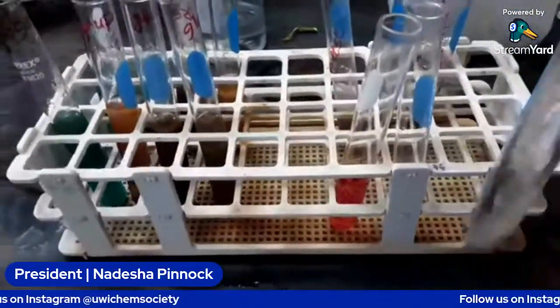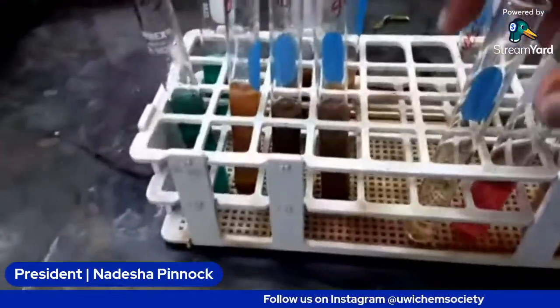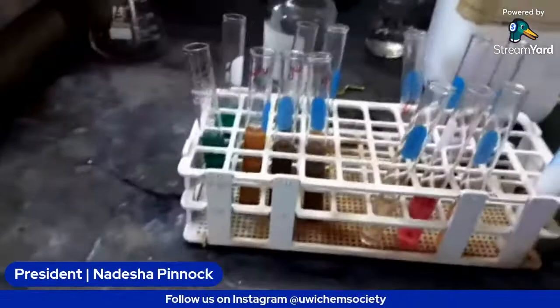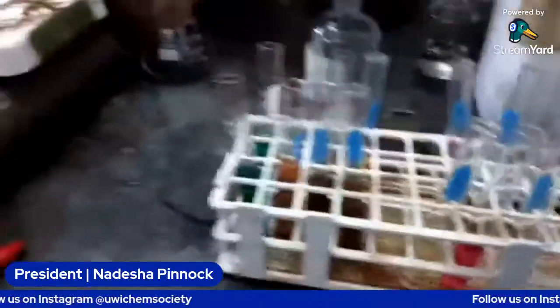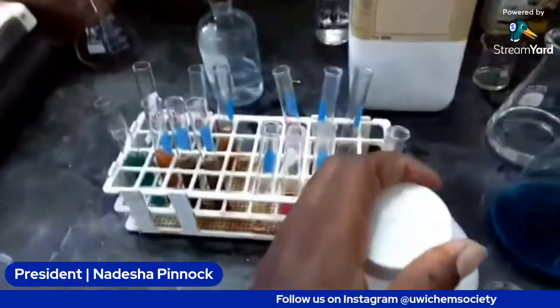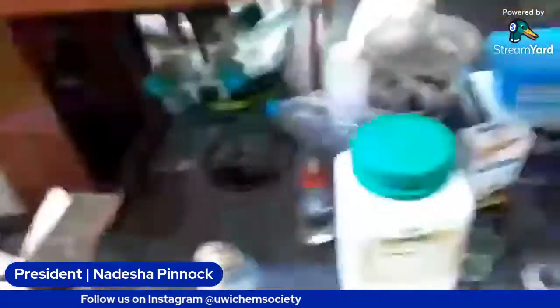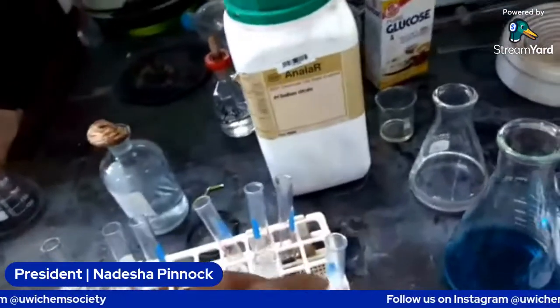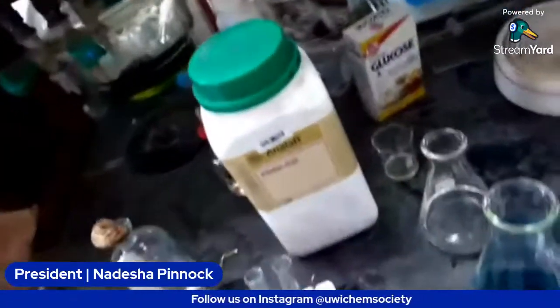So we shake it, make sure the acid is all throughout. And then we're going to add sodium bicarbonate. You can also use sodium carbonate. Both of them are carbonates, just one is stronger than the other. The sodium carbonate is stronger, but we don't have any, so we're using this as a substitute.